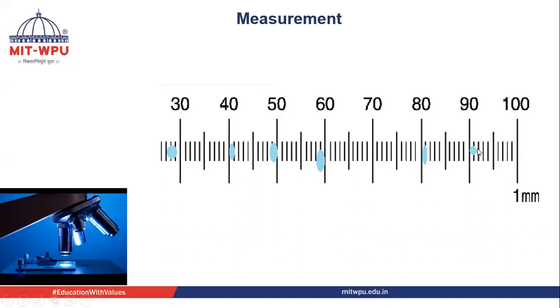Here I have tried to show some starch grains in blue color. We can see a starch grain, and to determine its diameter, we observe how many eyepiece divisions it covers. This particular starch grain has covered one division and extended into the next. If it extends more than halfway into the next division, we count it as two divisions. So this starch grain counts as two divisions. We take 25 different readings in this manner.